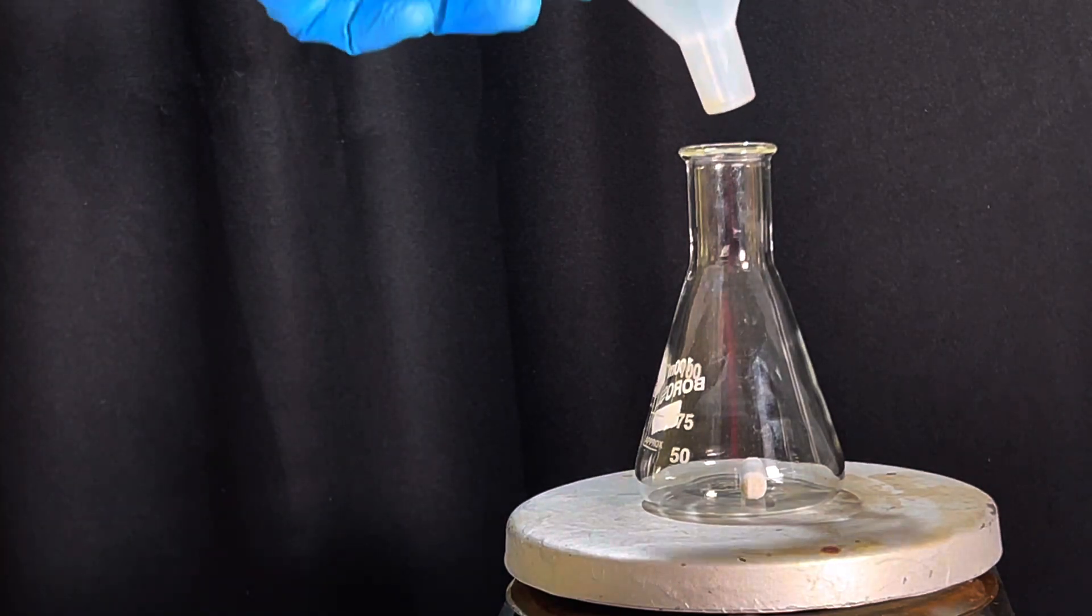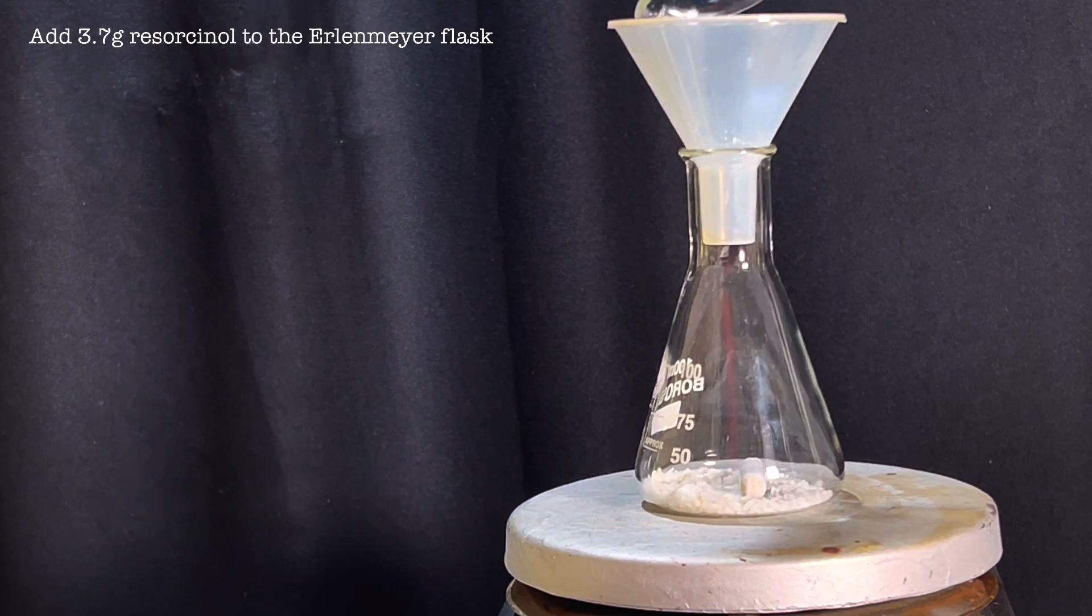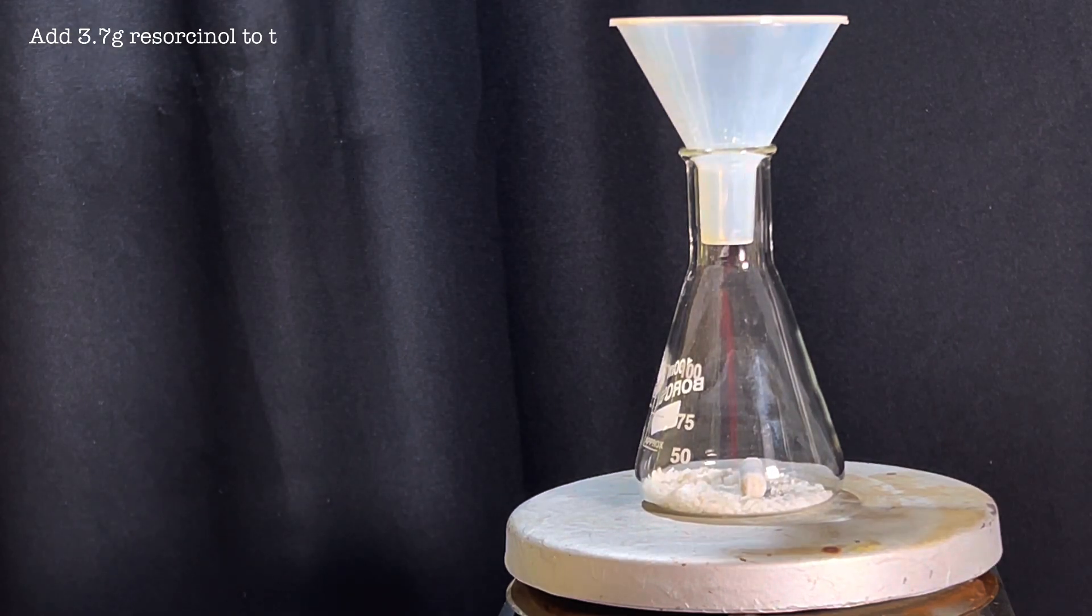Meanwhile, a 100 ml Erlenmeyer flask is taken and 3.7 grams of resorcinol was added to the flask using a powder funnel.